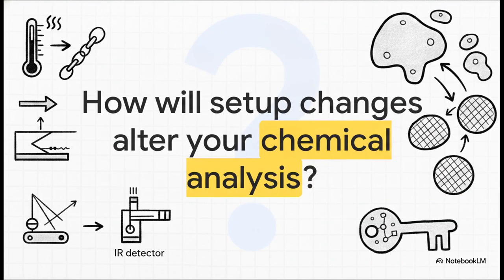And that brings us to the end of our physical walkthrough. Just think about the incredible control this gives an analyst. How might manipulating that high temperature, linking a custom 3-column series, or swapping a refractometer for an IR detector change the outcome of your next chemical analysis?